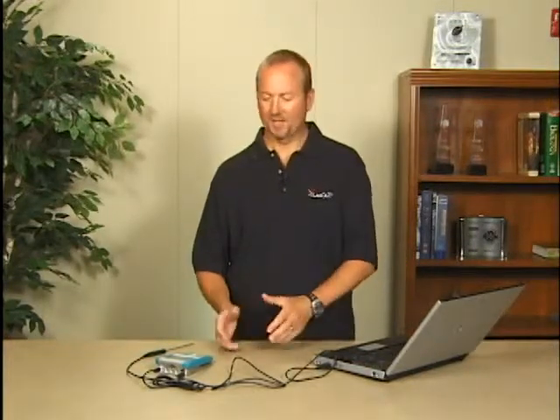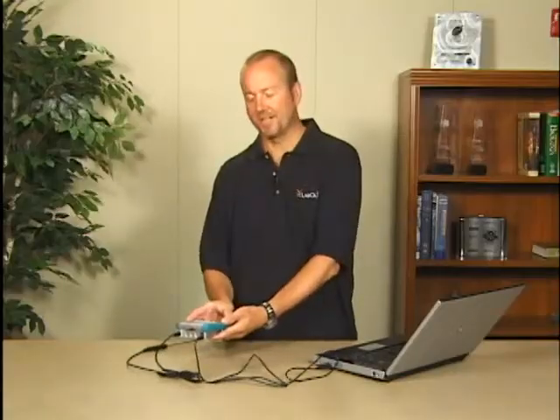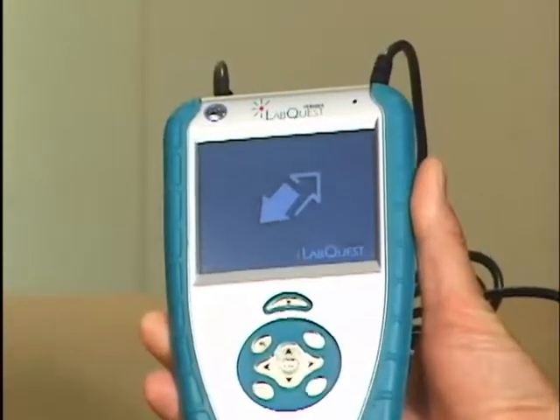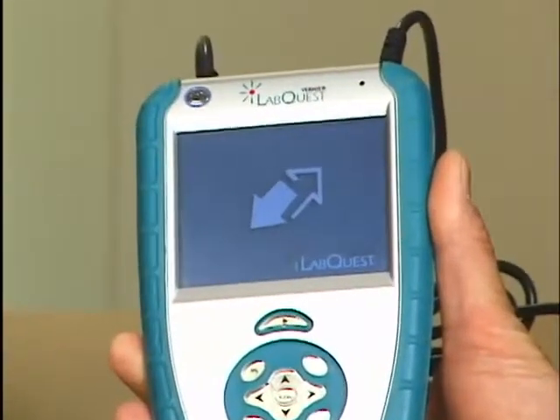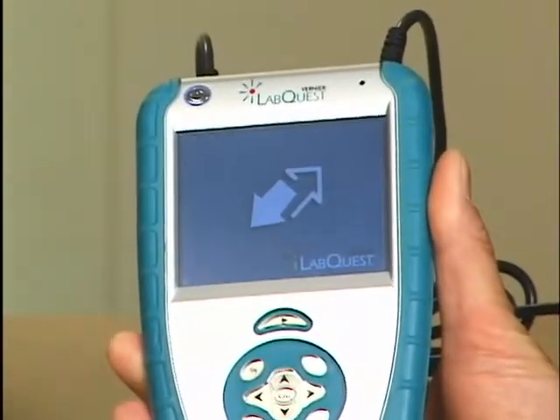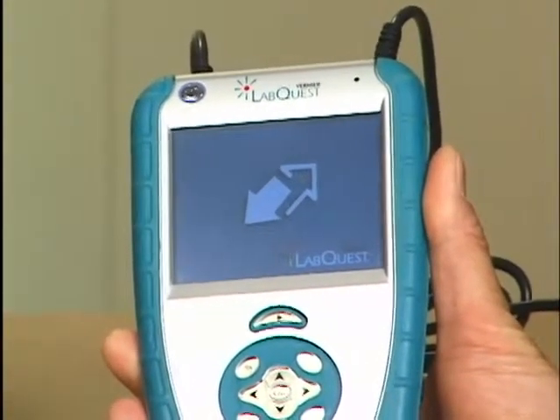Now Logger Lite is launching, finding the LabQuest, and you'll notice the screen on LabQuest has changed. This indicates that the computer is now in control of LabQuest and its data acquisition.